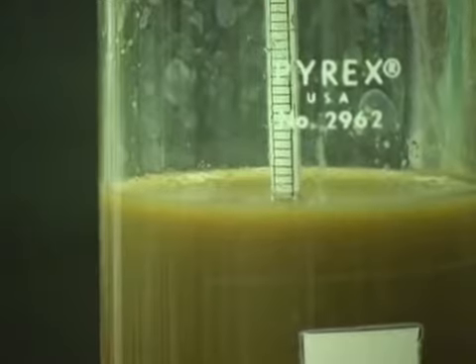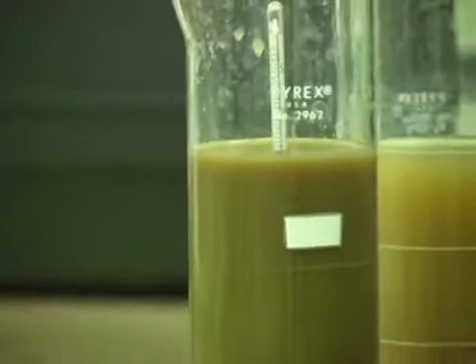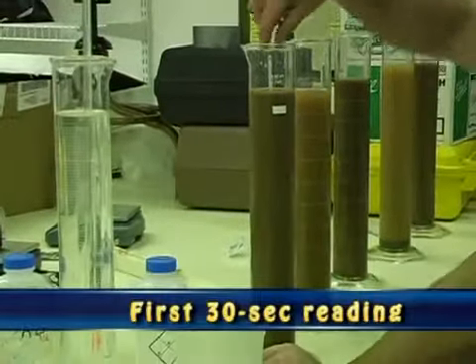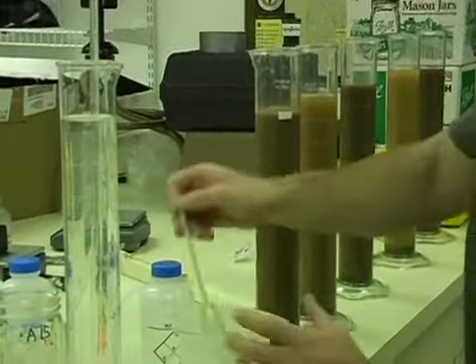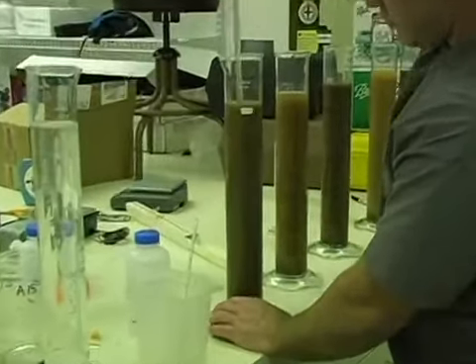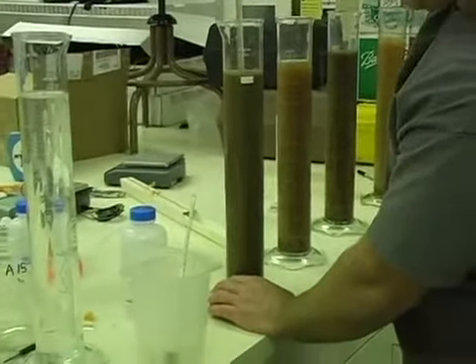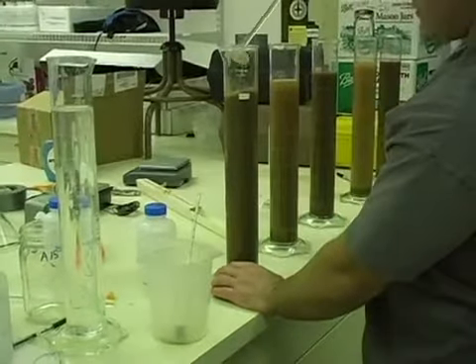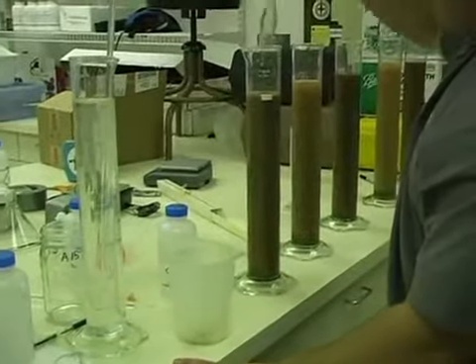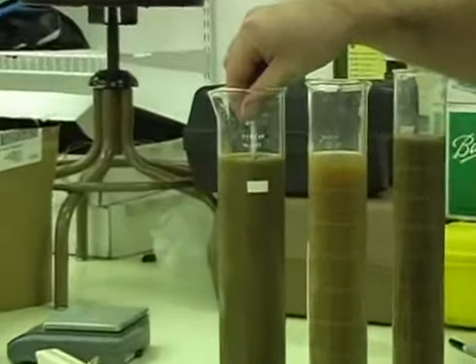It's 20. 5, 4, 3, 2, 1. 21. So the step's repeated 3 times at the 30-second measurement because the hydrometer drops so quickly during this phase when there's a lot of sand. So you need to have repeatability for the first one. So you do it 3 times to get an average.